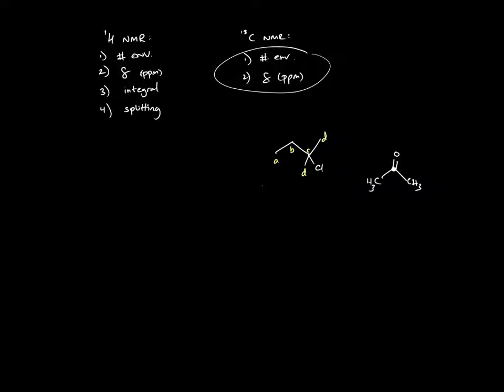All right, so the other thing we can look at is the chemical shift. In general, I'm going to break this down into kind of these simple categories. sp3 carbons usually appear somewhere between 0 and 35 ppm. So the scale for this is much higher. It's no longer 0 to 12, it's about 0 to somewhere around 200 plus. This is the ppm in terms of chemical shift. Or I should say the chemical shift in terms of ppm.